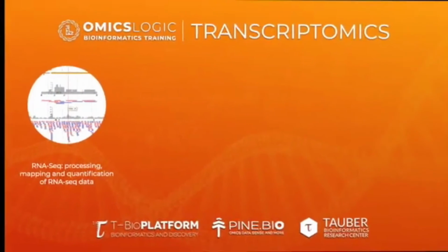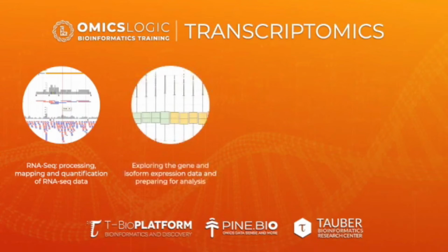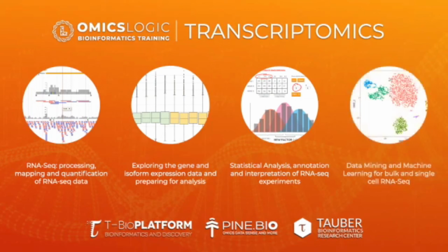In this program, we will see how, relying on analytical methods and reference databases, researchers can study RNA-Seq data to understand gene expression variation across many conditions. To do so effectively, bioinformaticians leverage big data processing methods organized into bioinformatics pipelines, and perform exploratory data analysis and normalization, apply statistical methods for rigorous hypothesis testing, and rely on data mining and machine learning.